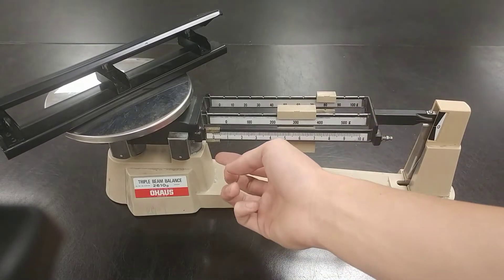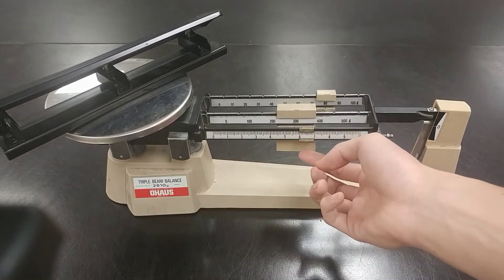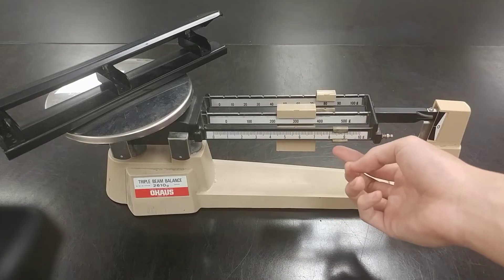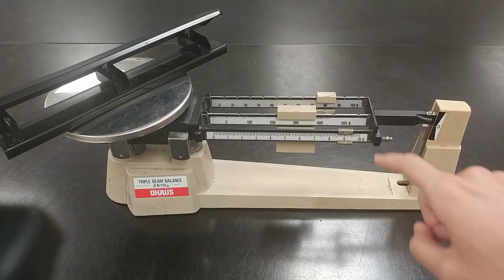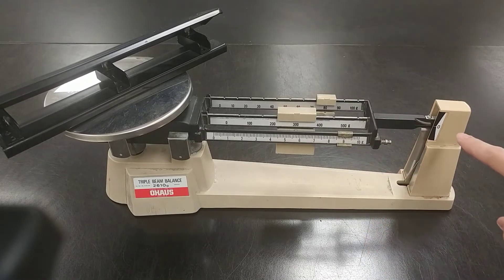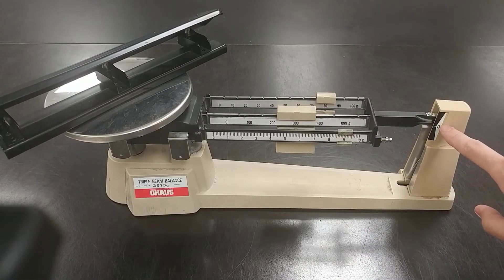And now we move the smallest one until we can get it exactly to zero. Right around 9, it is pretty much exactly at zero.